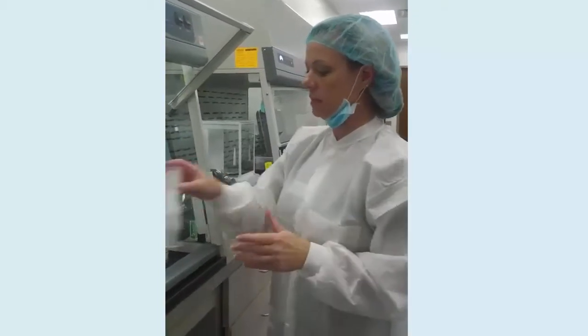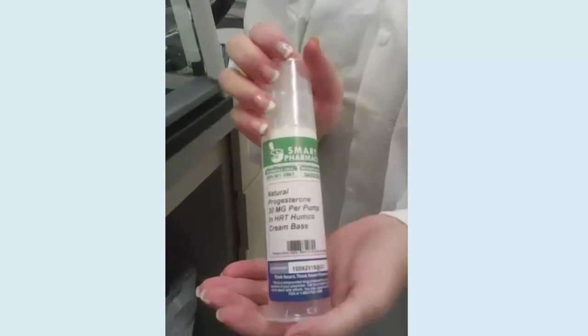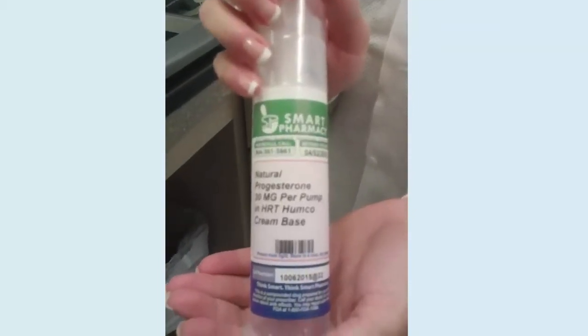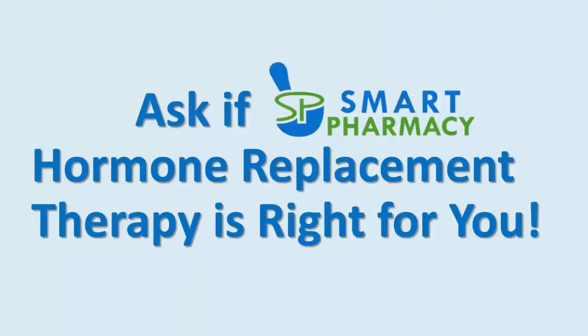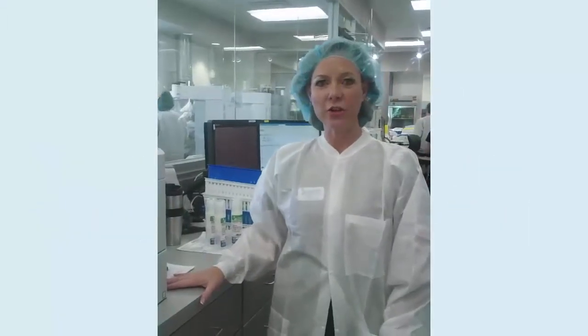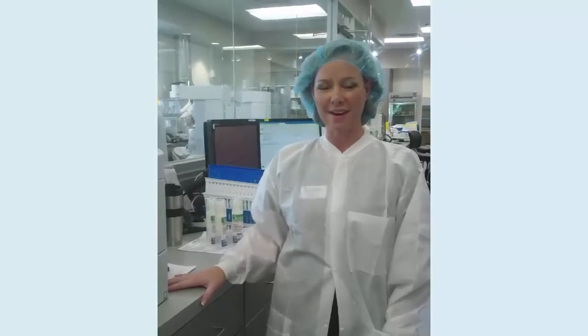When it's all said and done, it's a metered dose pump and you can pump it onto your skin as directed by the doctor. If you feel that hormone replacement might be beneficial to you, have your physician call us today at Smart Pharmacy, or you can visit us at SmartPharmacy.com.